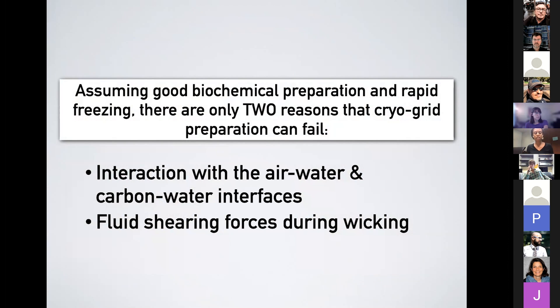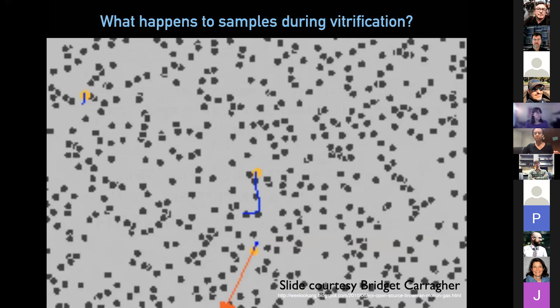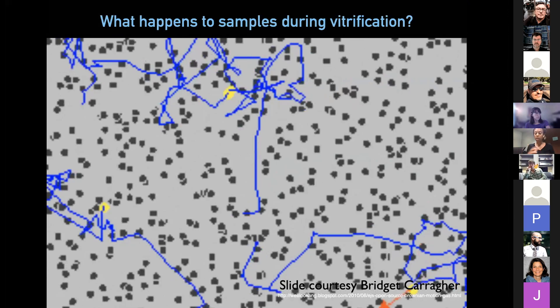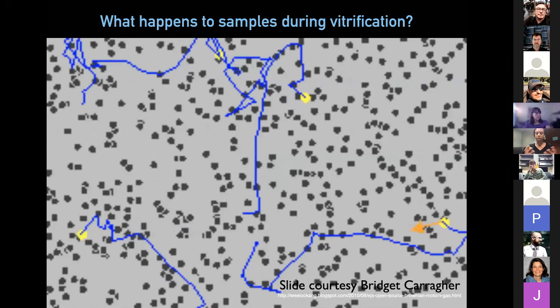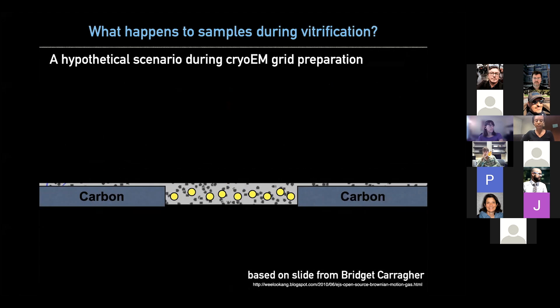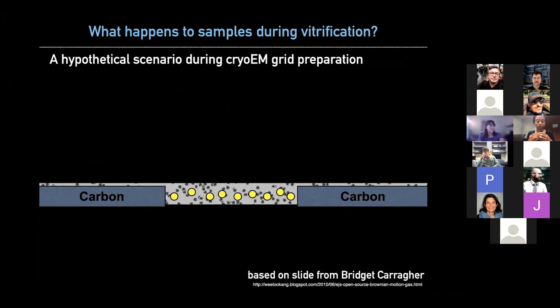Assuming you have good biochemical preparation and your freezing has been optimized, there are really only two reasons your cryo-EM preparation should fail. First, this interaction with the air-water interface in particular, and second, fluid shearing forces during wicking — during the process of blotting away your sample. What you're seeing here are your particles via Brownian motion moving within the liquid buffer applied to the grid. During blotting, you're removing a large portion of that liquid and hoping your sample particles are nicely distributed within the thin layer of liquid left between the holes of the grid.